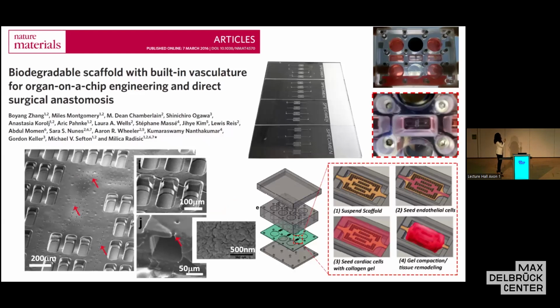But these micro holes that I mentioned, which you can see here as well, are actually critical because polymers are not permeable. Even elastomeric polymers such as POMAC are not permeable. You know polymers, plastics, plastic bags, Ziploc bags. You put your food in a plastic bag to separate it from the environment, right? And we know blood vessels are not separated. They're actually communicating with the tissue all the time.